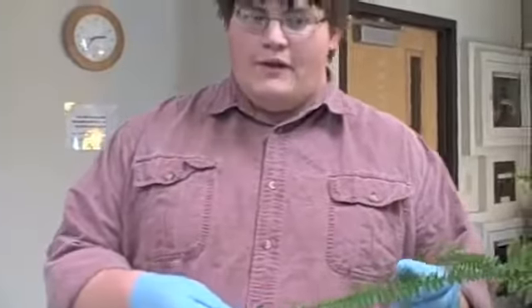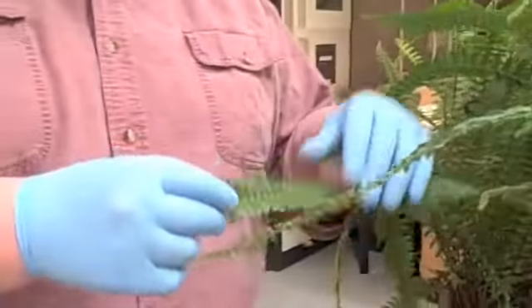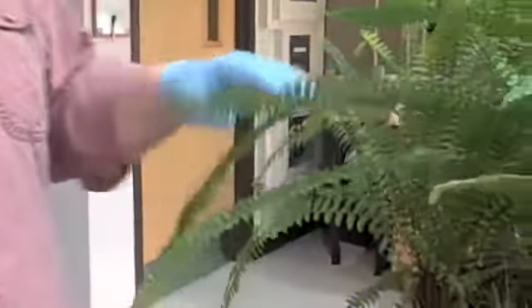This afternoon on Botany Lab Today, we're going to be going over the life cycle of ferns. Ferns represent one of the most primitive forms of plant life we see on planet Earth. Ferns reproduce primarily through the use of spores. And if you look on the underside of one of these fronds, you might see little brown dots. We call these dots sori.